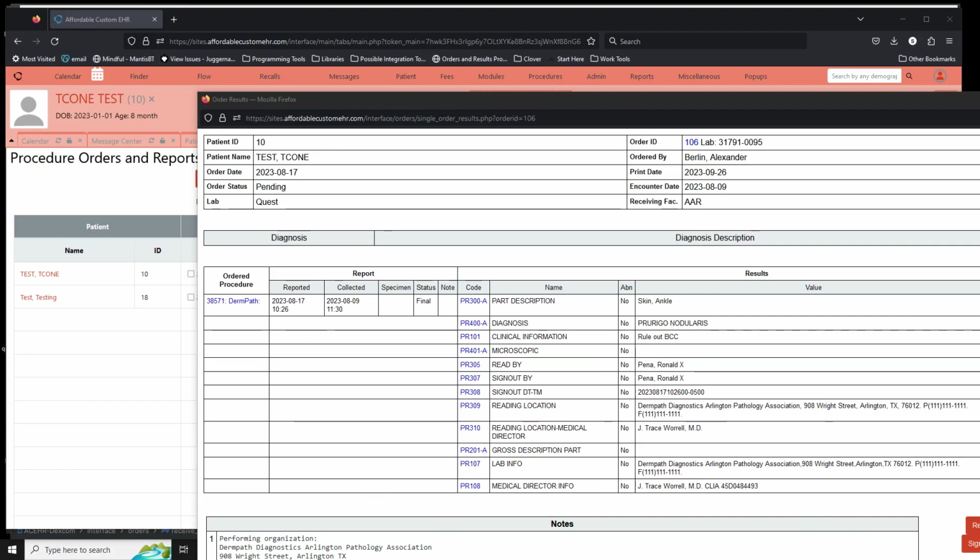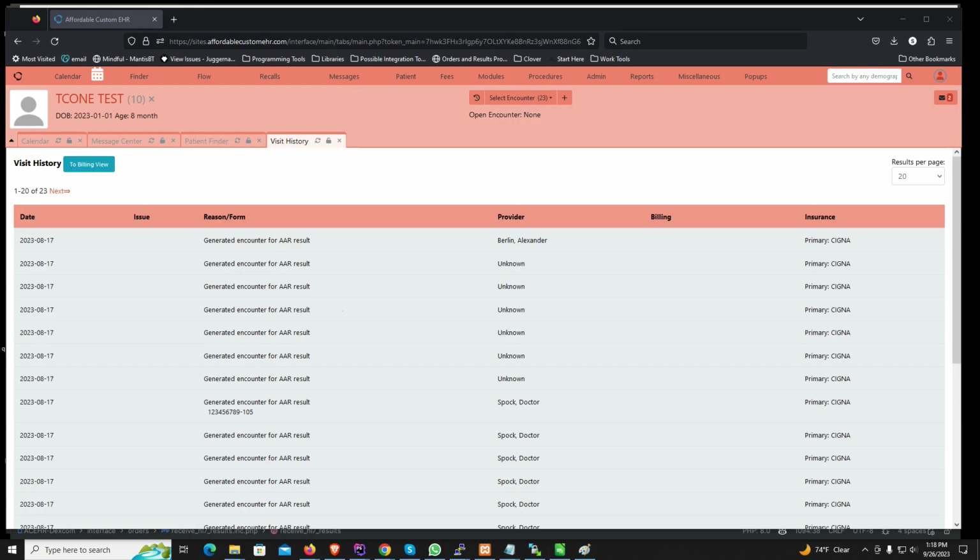Ron, I thought I'd do a video because this would be a lot faster than me trying to type all this out. So I'm going to show you how our system works, OpenEMR, and then from there you can see what we do. And for anybody else watching this video, this is a test patient. This is not a real patient. These are for test purposes only.